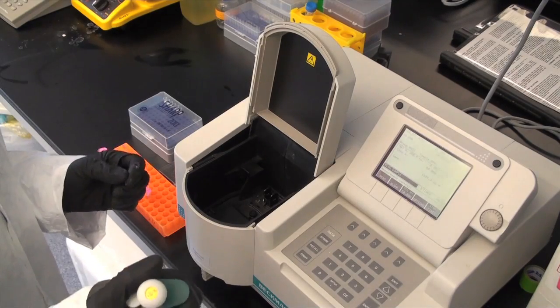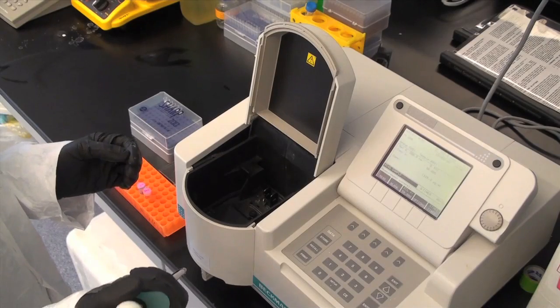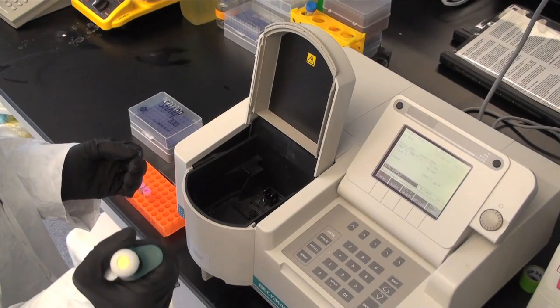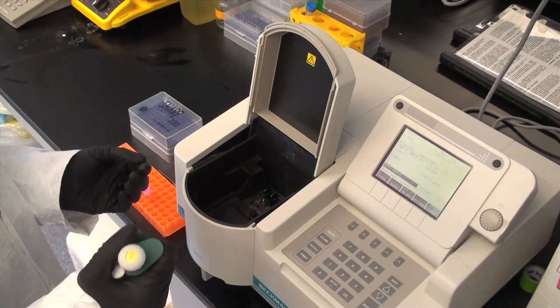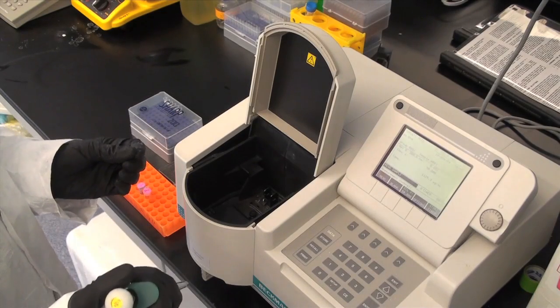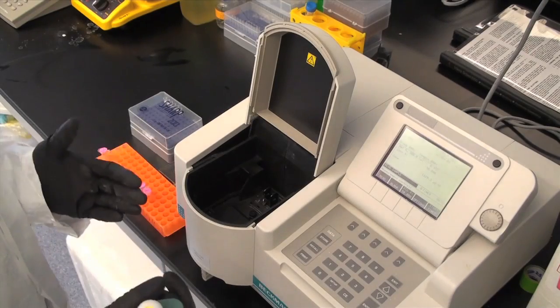Principle: A spectrophotometer consists of two instruments, namely a spectrometer for producing light of any selected wavelength and a photometer for measuring the intensity of light. The instruments are arranged so that the liquid in a cuvette or plate can be placed between the spectrometer beam and the photometer.